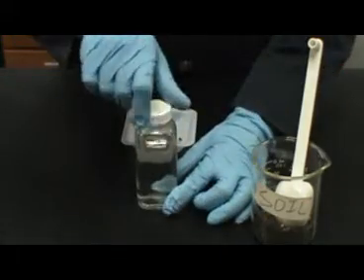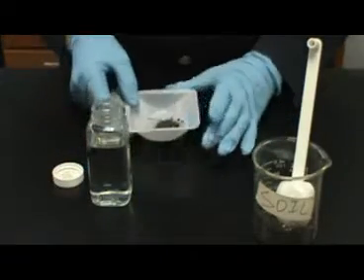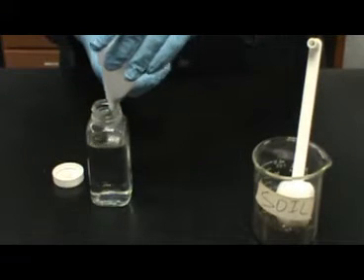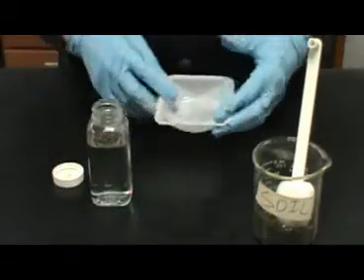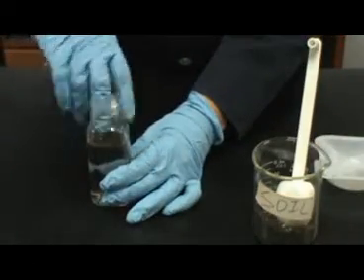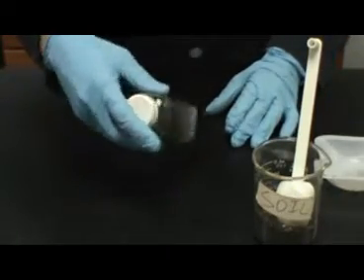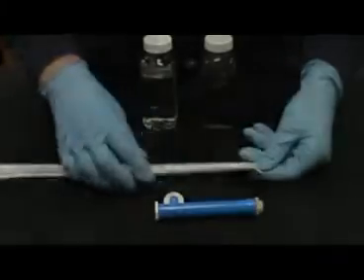You will now add the 1 gram of soil to 99 milliliters of a peptone solution. Carefully pour the soil into the peptone. Replace the cap. Shake the sample vigorously and allow it to sit for approximately 1 minute. The 1 gram of soil in 99 milliliters of solution has a dilution factor of 10 to the negative 2.